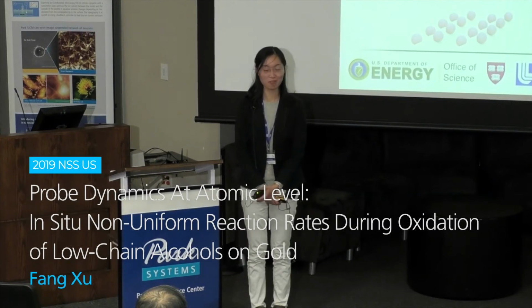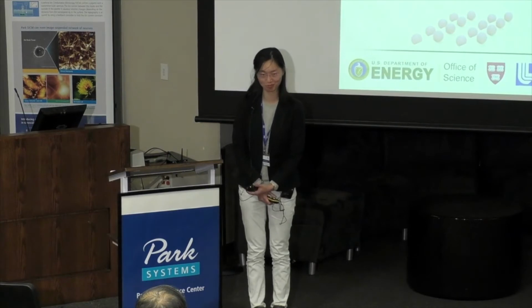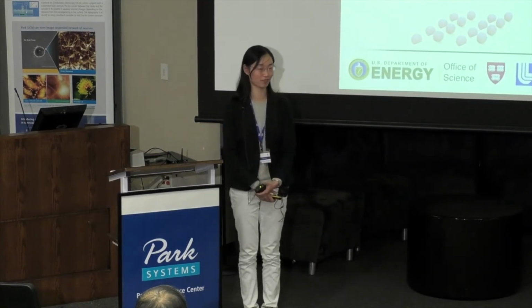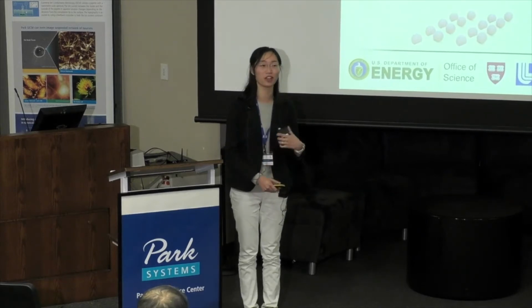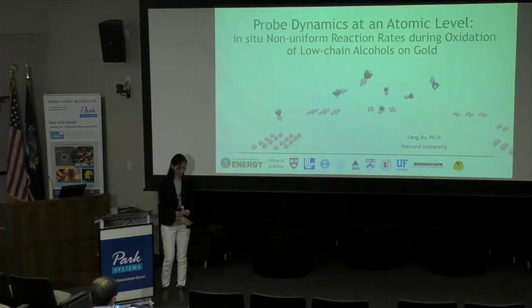Okay, so for my research, I'm a chemist by training. I also use a scanning tunneling microscope, a very similar tool. We are interested in heterogeneous catalysis and surface structures and how that can give us more insight into chemical reactions.